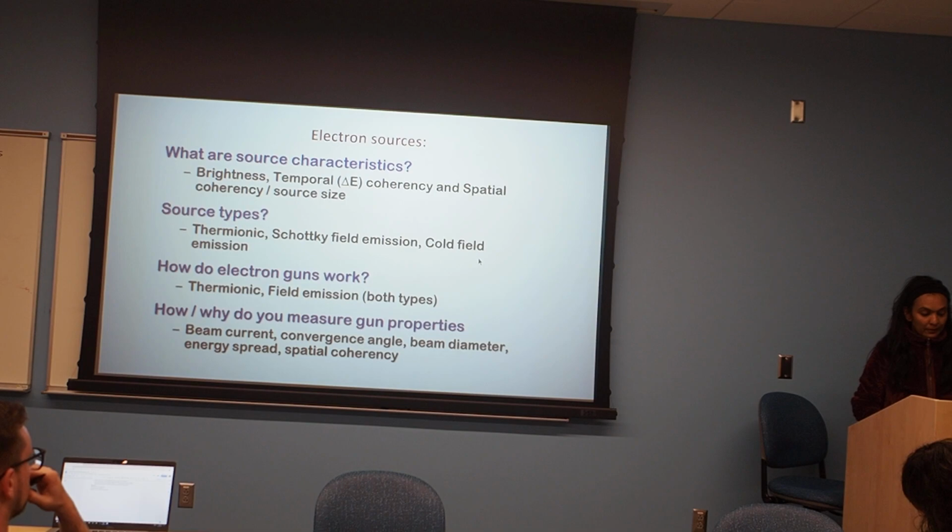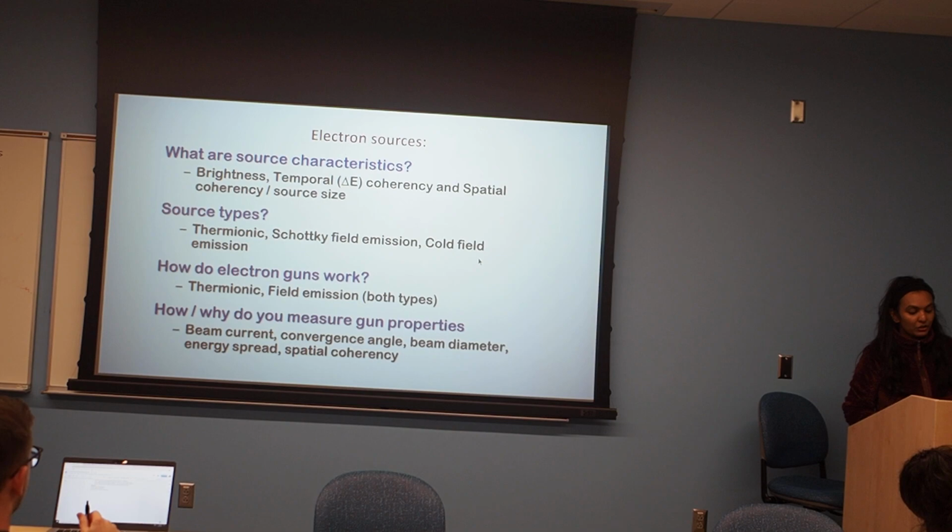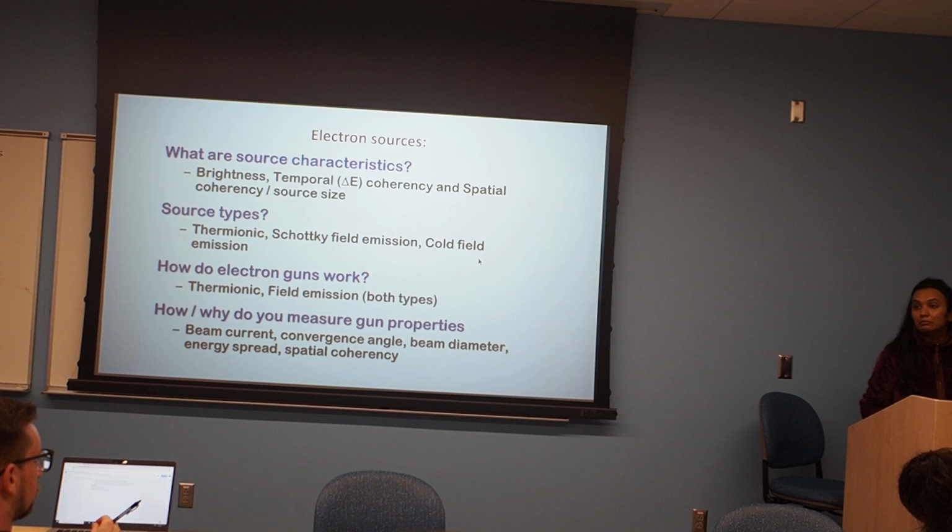Now, how do electron guns work? They work by the principle of thermionic or field emission. We'll come to that. And how do you measure gun properties? You measure the gun properties by beam current. How many electrons per second?